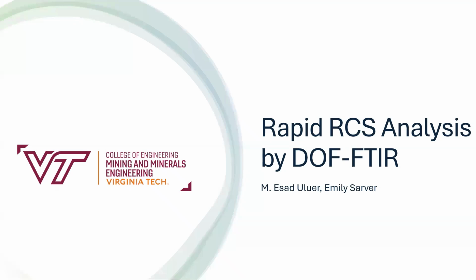My name is Esad, and I am a postdoc in Mining and Mineral Engineering Department at Virginia Tech. I'm working in Dr. Sarver's group. This presentation will deliver information about rapid silica analysis by direct filter FTIR.